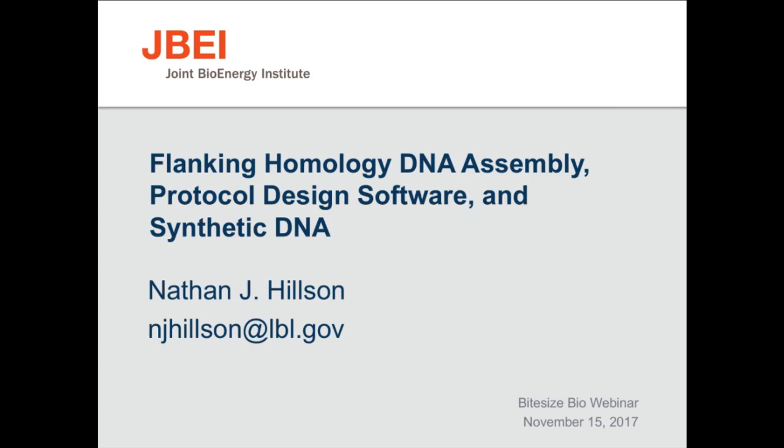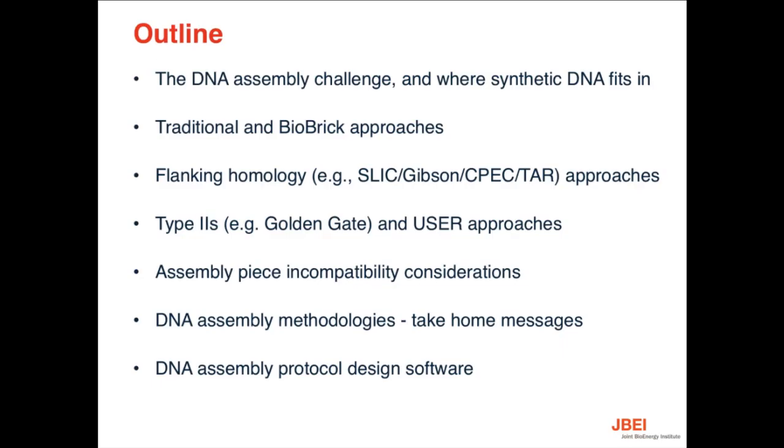As Amanda mentioned, I'm going to be telling you a little bit about DNA assembly. I'm spending a little more time on flanking homology methods, and then touching upon protocol design software and synthetic DNA. As a brief outline, I'm going to start with what the actual challenge with DNA assembly is and where synthetic DNA fits in.